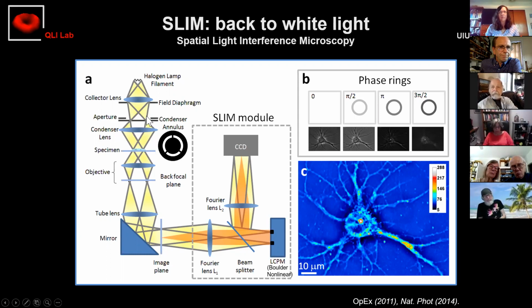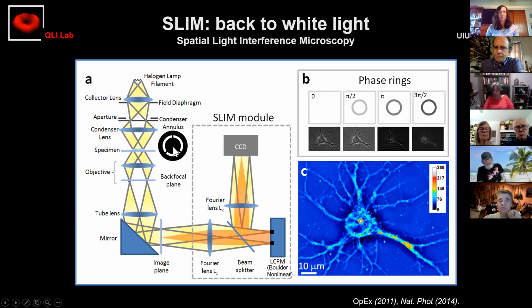It comes from the aperture of the condenser. So imagine that the incident light is all focused along this ring. And Zernike created a thin layer here that shifts that incident light by pi over 2. So essentially what he did, if you remember that equation I mentioned earlier, where you have a cosine, he converted it into a sine. So for small arguments, if you remember from high school, the sine of x is approximately linear in x. So it's good. The intensity is proportional to the phase.